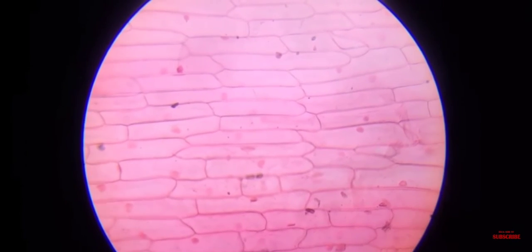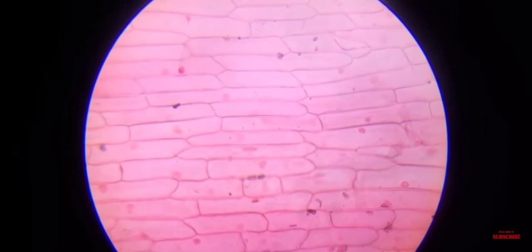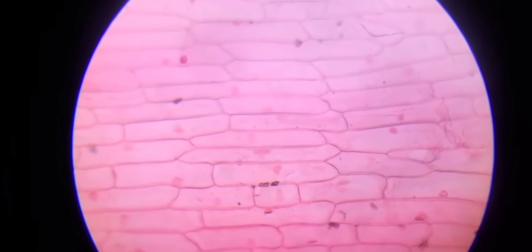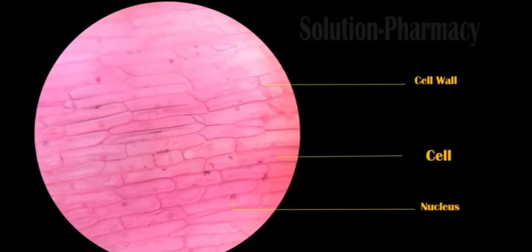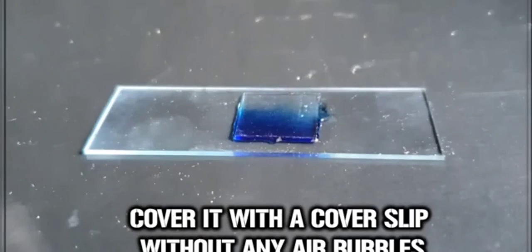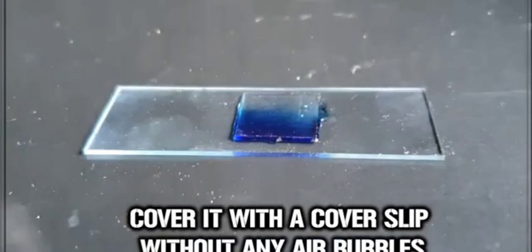They are rectangular in shape. Intermediate space is not present. Then tiny spots, which are the nucleus, are seen here. So these are the parts. When we are using methylene blue, the slide will appear in this way. So when methylene blue is used, you can perform this activity to observe the nucleus very clearly.